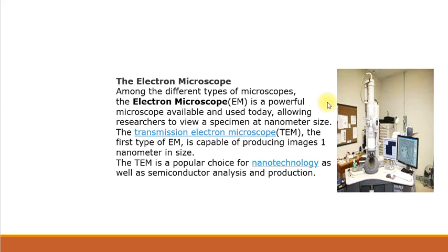And this is the transmission electron microscope, the first type of electron microscope, which is capable of producing images 1 nanometer in size, such a high resolution. And the TEM is a popular choice for nanotechnology as well as semiconductor analysis and production.